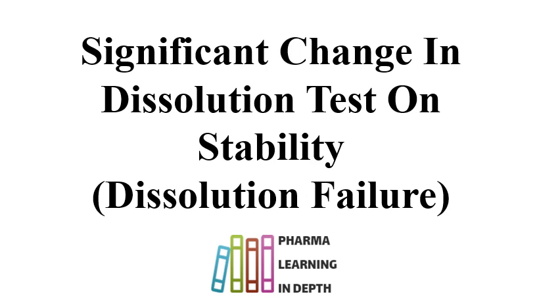Dissolution failure for the stability samples may happen during the research phase, during the exhibit stage, or before application, or it may happen during the marketing or commercial production stage.